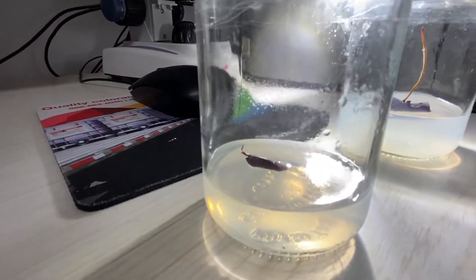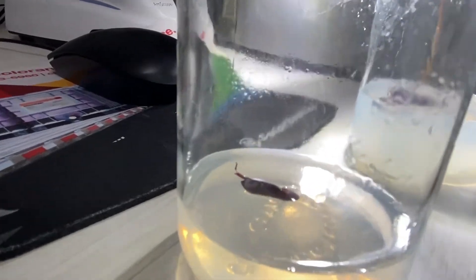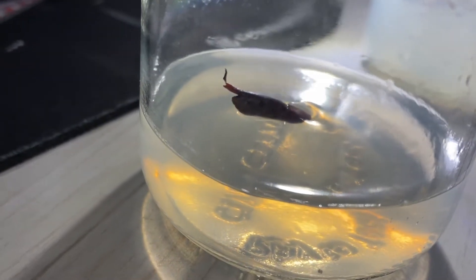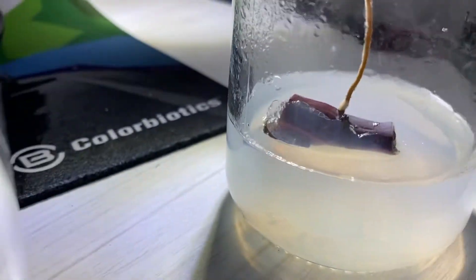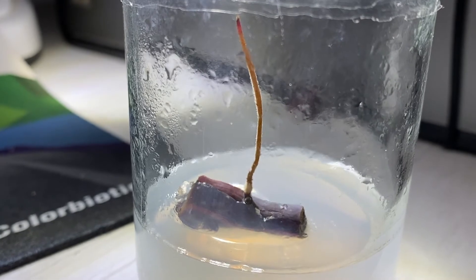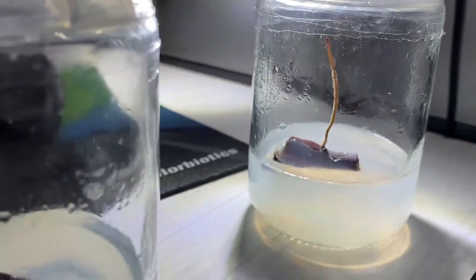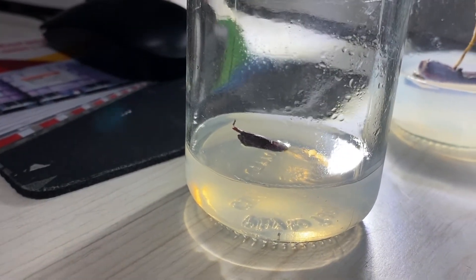I don't think we're going to cut it up just yet because it's still a little bit small, but hopefully in the next few days we will get in there. Cam, are we going to take that shoot, cut it off, and then put several pieces in an agar plate? I think that's what we're supposed to do — yeah, we'll cut that little shoot off and very carefully slice it in a sterile environment and put it in its own agar plate. This guy, I don't know what to do with him, so we'll check with our buddy Steve. There is your pink princess update and we will film when we cut it up.